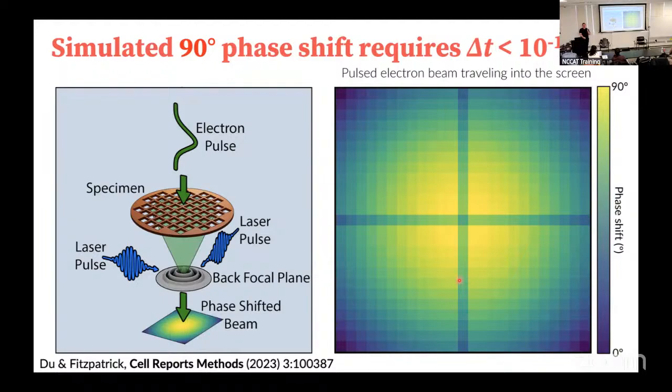Yes, to your point, I started out by talking about these terrible magnetic lenses that we have, and there's all sorts of things that you wonder why no one's trying. These days you could 3D print very different types of electromagnetic lenses for microscopes. It's just that the view we have is, if it's not broken, don't fix it.